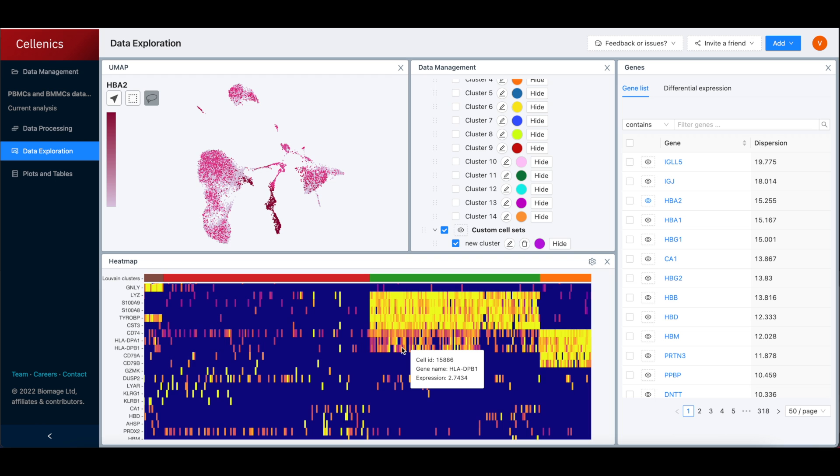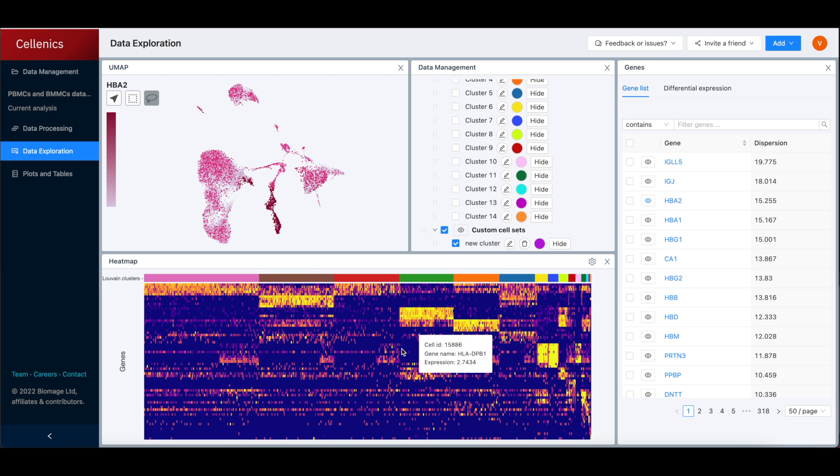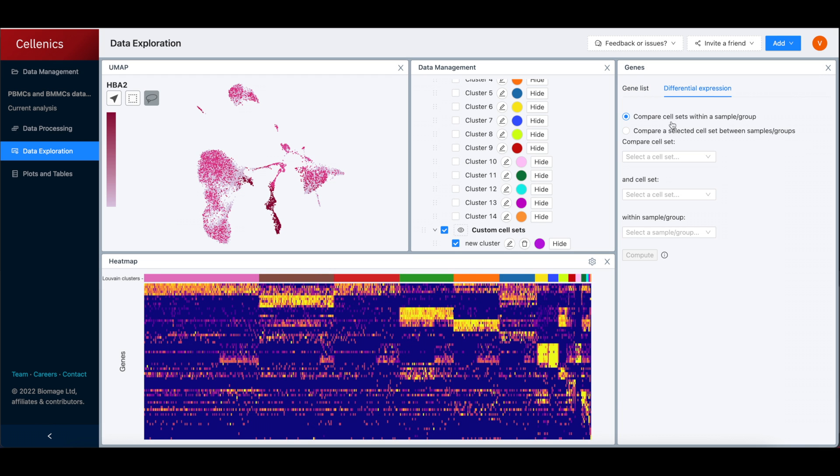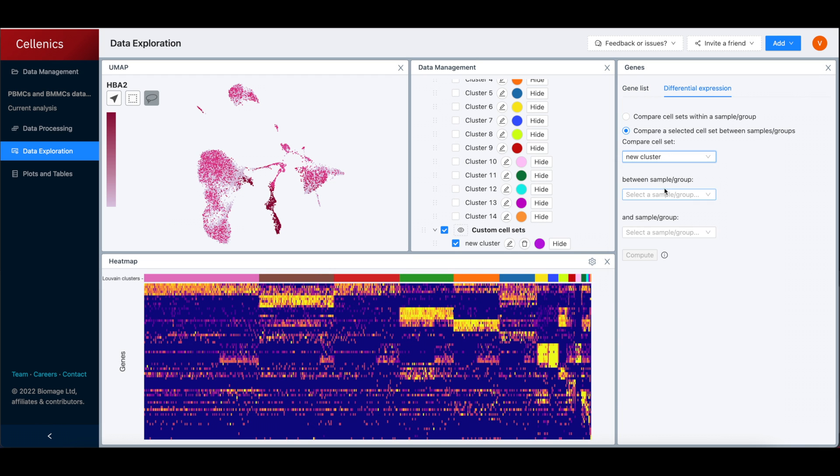Default clustering analysis is shown, while custom clusters can easily be created, renamed and colored according to user needs.